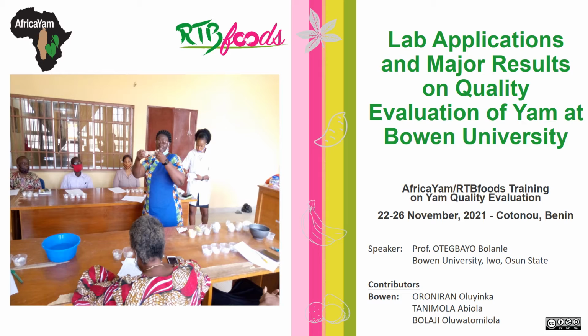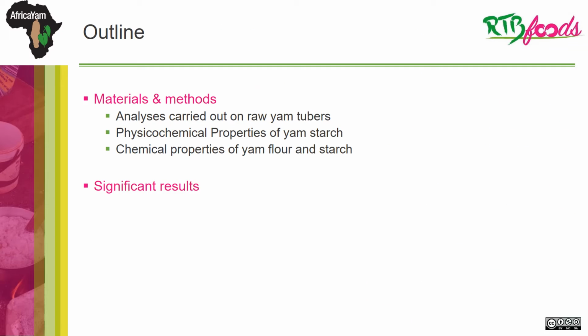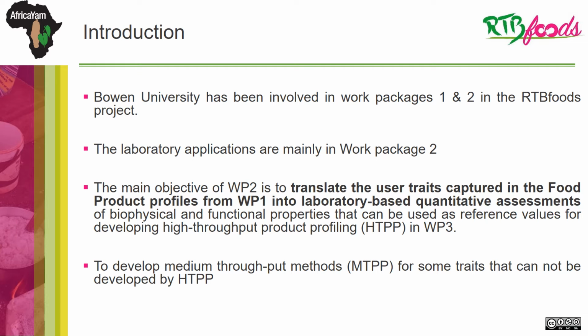The title of my presentation is Lab Applications and Major Results on Quality Evaluation of Yam at Bowen University. The outline is presented: materials and methods, analysis carried out on raw tubers, physicochemical properties of yam starch, chemical properties of yam flour and starch, and significant results.